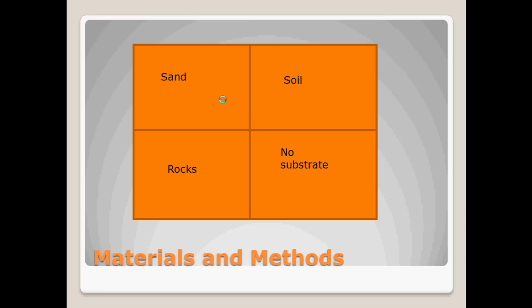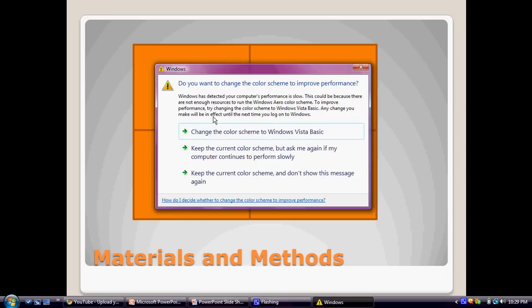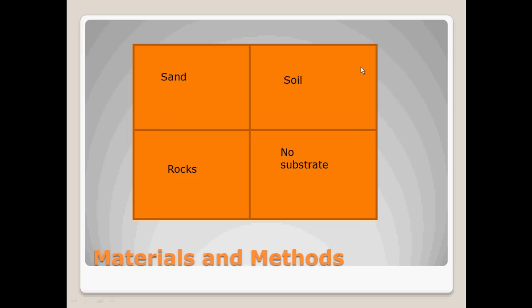The materials and methods used for this experiment were stated in the Lab 4 protocol entitled Animal Behavior 2, Territorial and Sexual Behavior. There were no changes in the protocol. For the substrate testing part of the experiment, the cage was set up with 4 squares containing a different substrate. It was done in this pattern so that the cricket would not go over one substrate to get to another. This picture right here shows how the cage was set up.